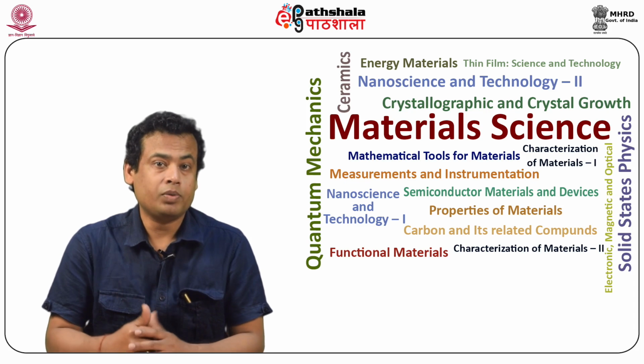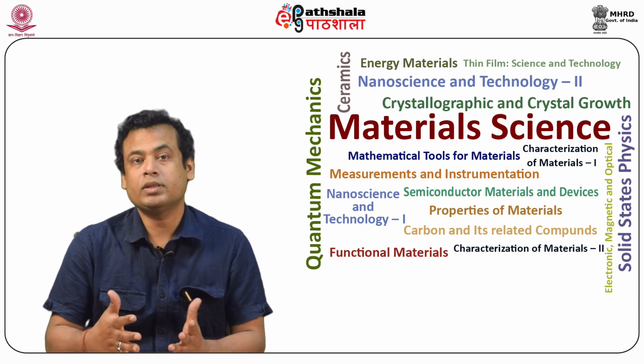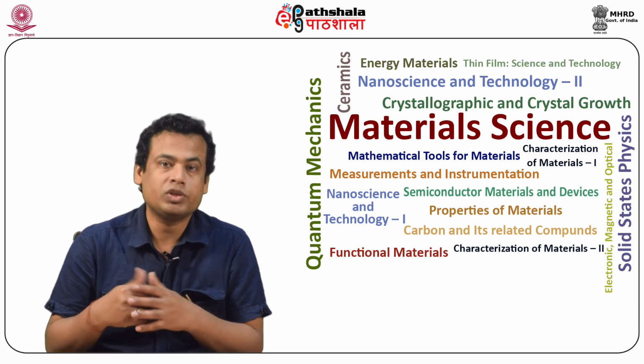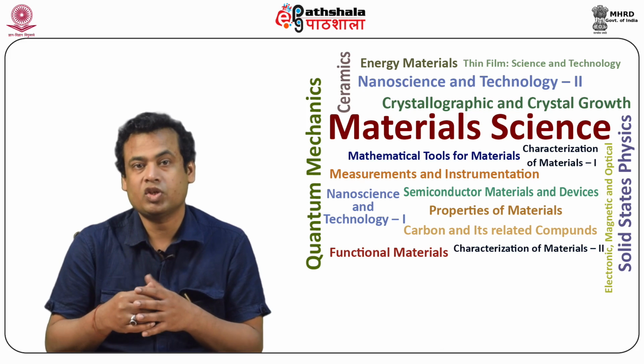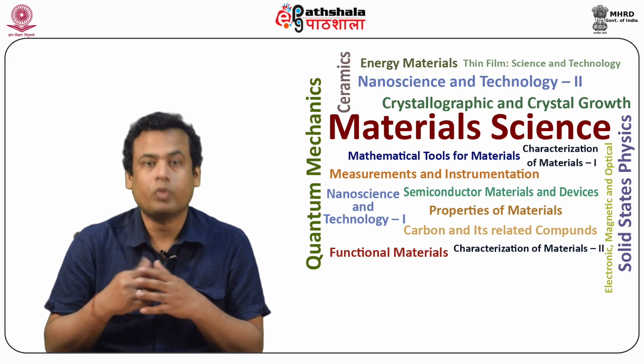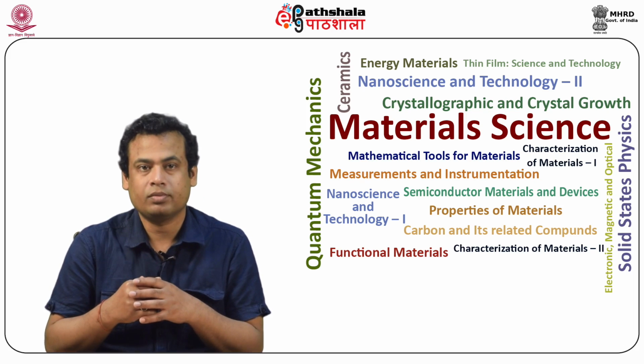The surface morphology and topography. Here, morphology is a qualitative evaluation of the three-dimensional shape of a surface, and topography provides the quantitative dimensions to the feature.